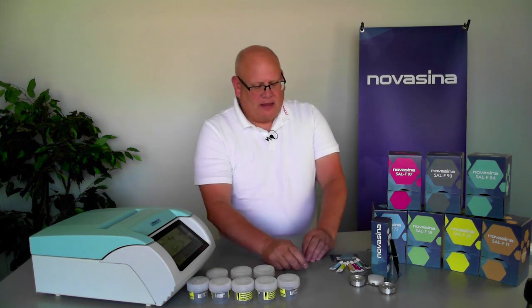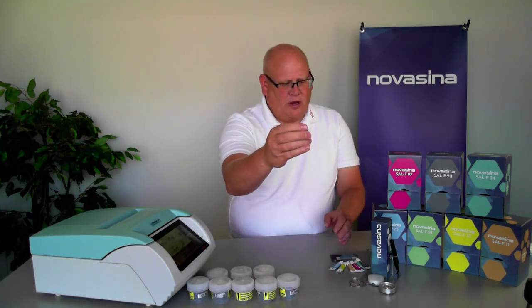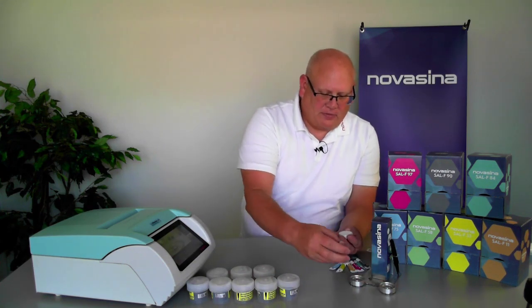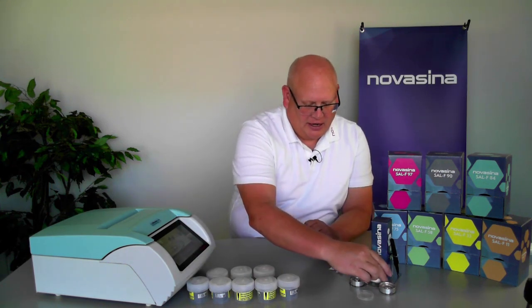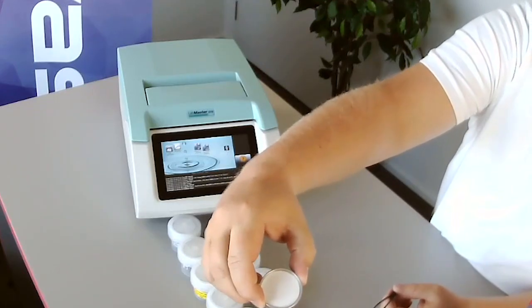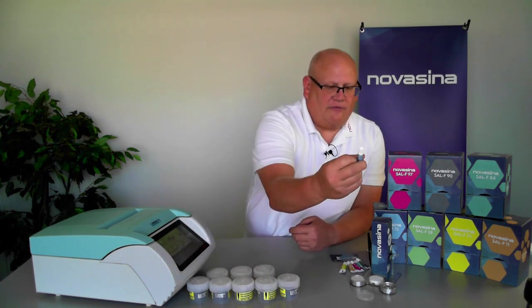Now we'll show how to run a calibration verification using the SAL-F standards. The process is a little different from the SAL-T. In this case, you're going to use the aluminum cup that comes with the SAL-F calibration kit — you have two of these aluminum cups. We also need a filter pad; there are several filter pods within the box, and within each cup there are many filter pads that can be utilized. You'll take the provided tweezers, get one of those filter pads out, and place it in the aluminum cup. Then you'll take one of the standard vials.